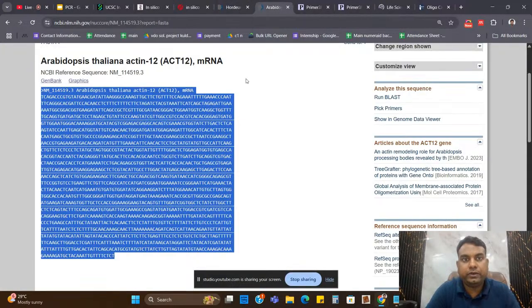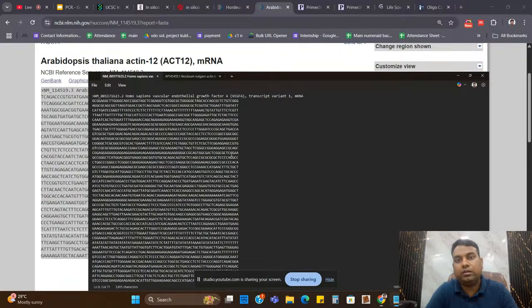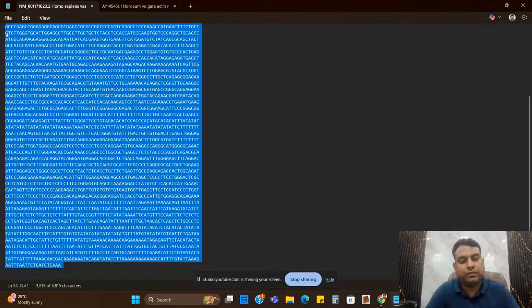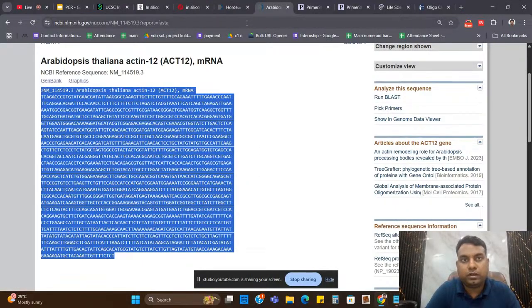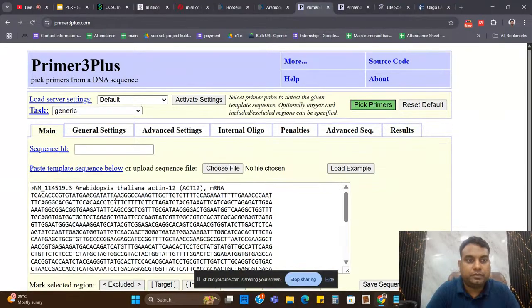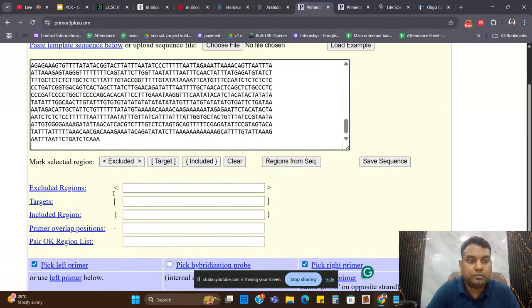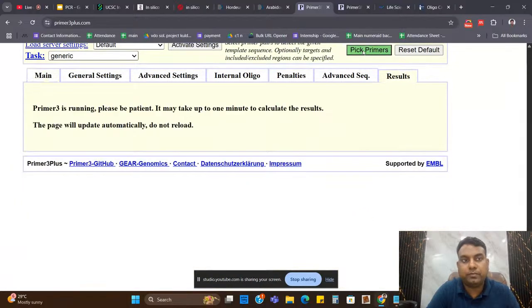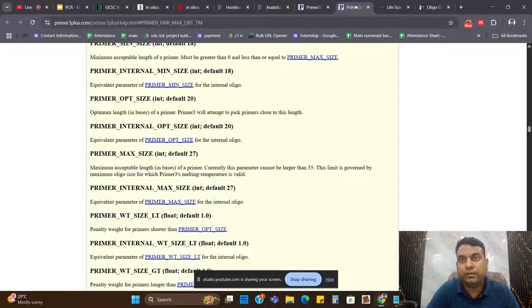Meanwhile, we can do primer designing also for one human sample, because in the validation phase we are going to check on human also. So let me do one thing. Go to main. You again keep everything the same. We just click on pick primers. It will take a little time.